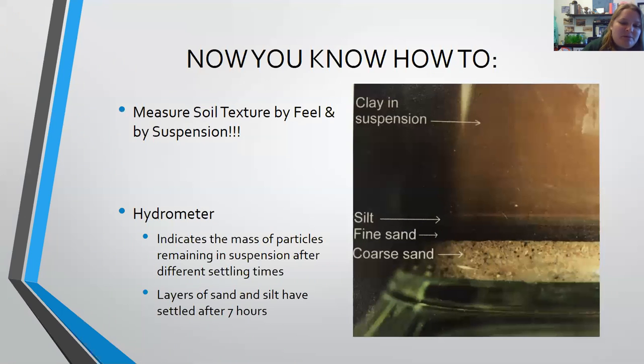And also because of the time limit, if you had been able to leave the soil in the water in that graduated cylinder and really allowed things to settle out, it would eventually look like this image here, which I just thought some of you might find pretty cool. But again, to really get to this point, I think was after 7 hours, and we obviously don't have lab for that long.